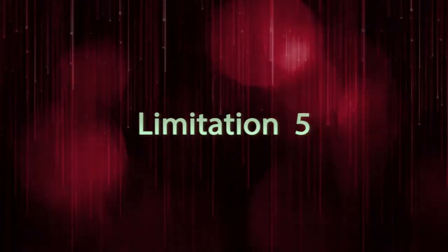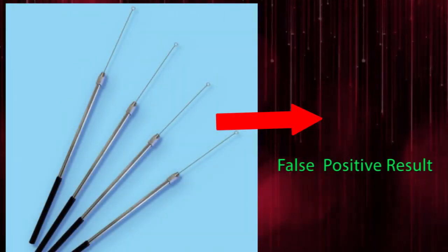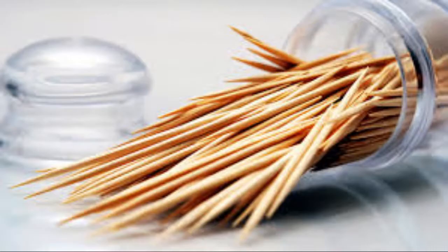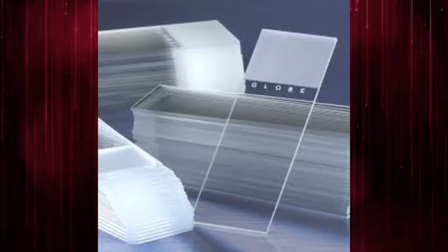Limitation Number 5: Use of a nichrome or other iron-containing loop may yield false positive reactions. Therefore platinum loops, toothpicks, or corner of the slide are recommended.